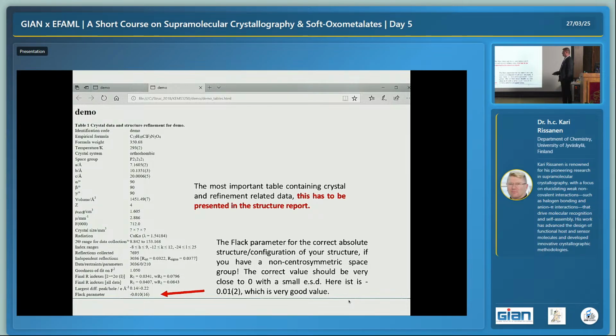And then this is also an important point. You have a largest difference. It means what is there when all the atoms are taken out. So that's the background, and it's 0.14. Remember yesterday I told you that hydrogen, if it would be there, would give 1. So we know that it can't be any.